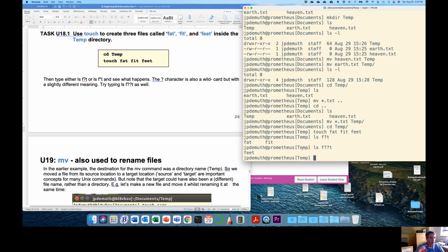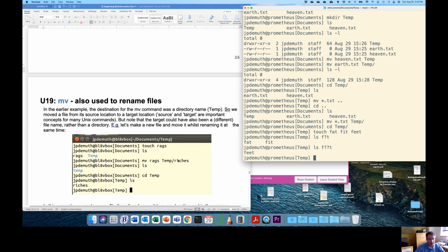I want things that start with this 4-letter code and then any 2 numbers, and that could be one example where something like that would be useful to pull those reads out.